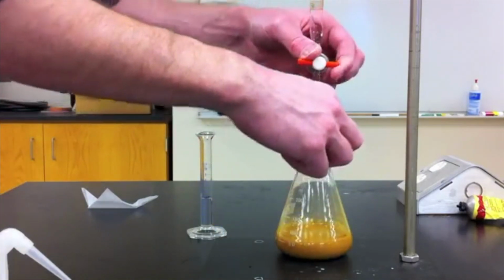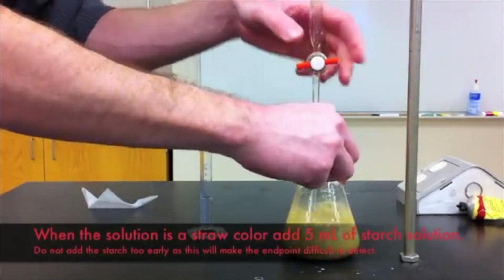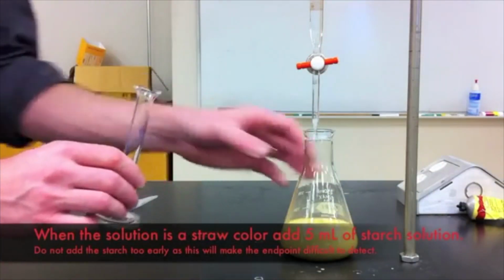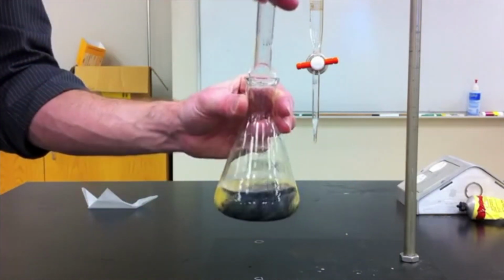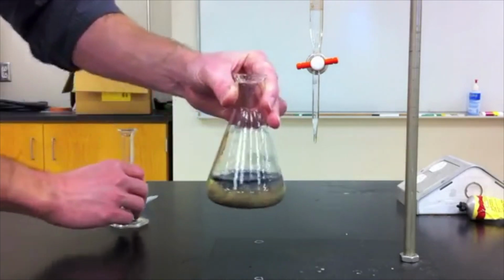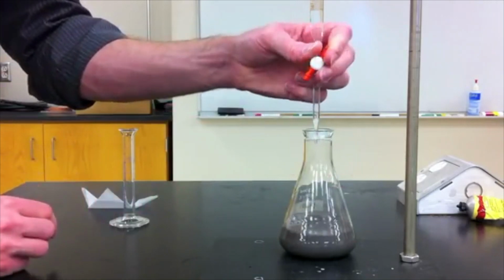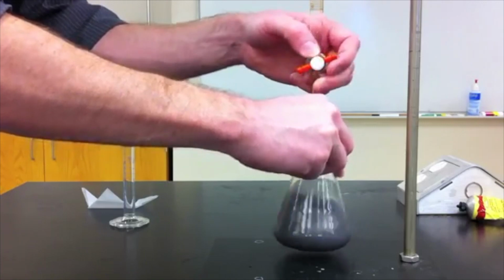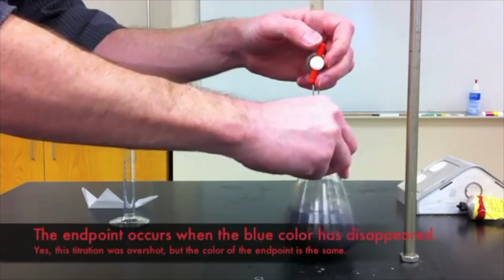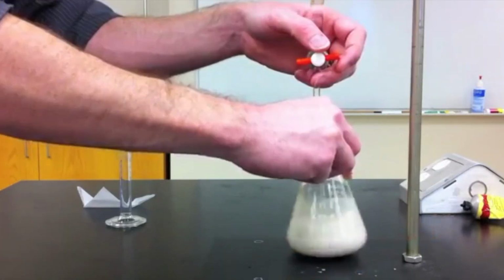Now if we were to add starch to this and add thiosulfate, we wouldn't see the colour change. So what we tend to do is we tend to add the thiosulfate until the cloudy brown solution goes a straw-coloured yellow solution, and then we add the starch and your solution will go blue-black, and then we continue adding the thiosulfate until the blue-black colour disappears at the end point. And when the blue-black colour disappears, we have our end point and we know the volume of thiosulfate needed in the reaction.